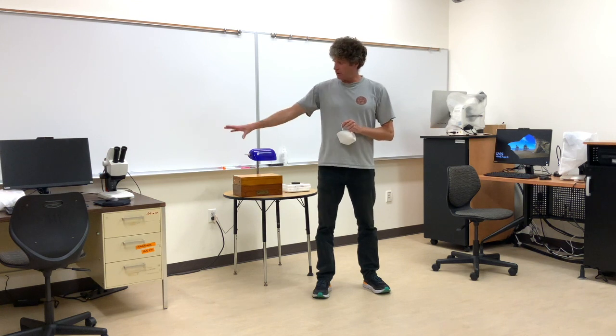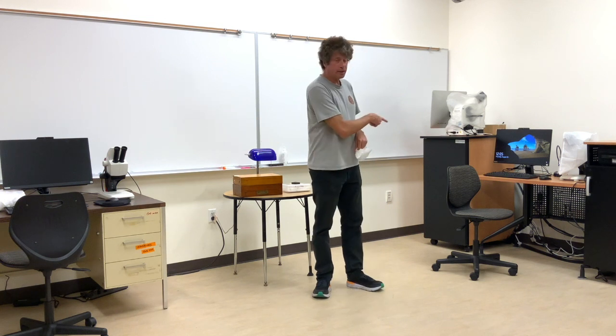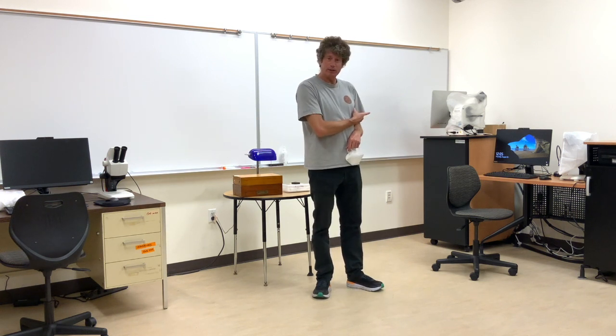This one on the left has a Z builder and this one over here has an ultraviolet setup. I'm going to show you the ultraviolet setup because that's the more complicated one.